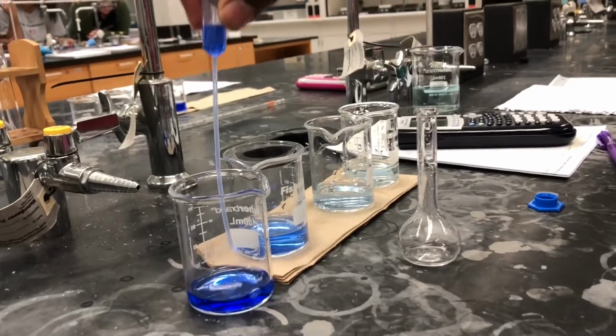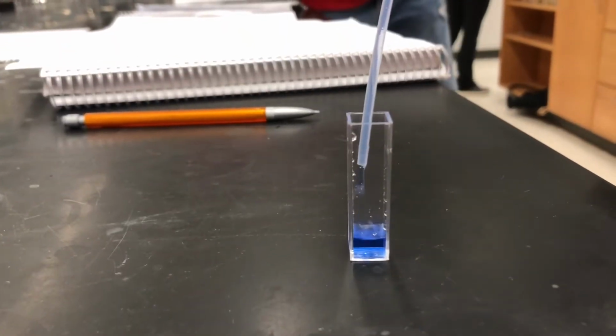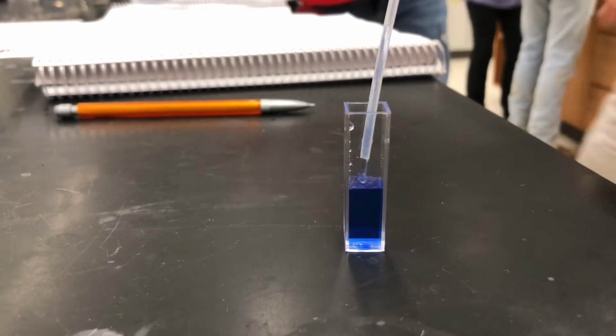Using a pipette, we begin by transferring some of the stock solution into a cuvette. Make sure that the meniscus does not pass the cuvette marking. We will prepare a blank cuvette in the same way. Next, we will begin transferring our dilutions into the cuvettes as well, following the same technique.